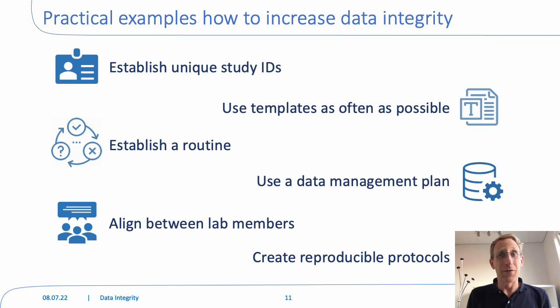So this is a summary of these 6 steps we have talked about. And taking these suggestions to heart and implementing them in the lab, one way or another, will be a big step forward to achieve data integrity and have a sound system in place.